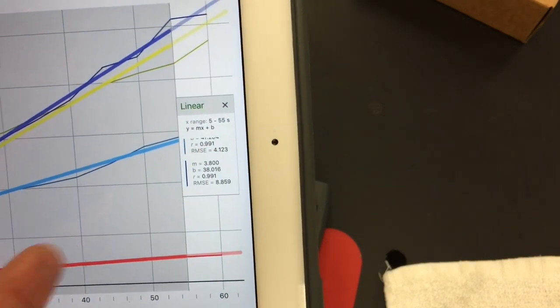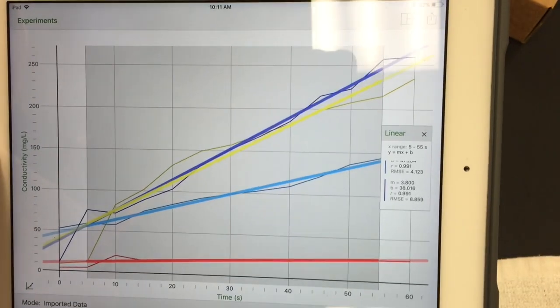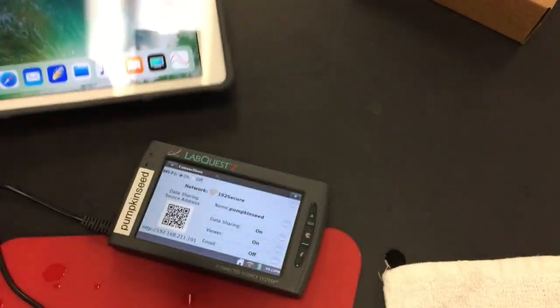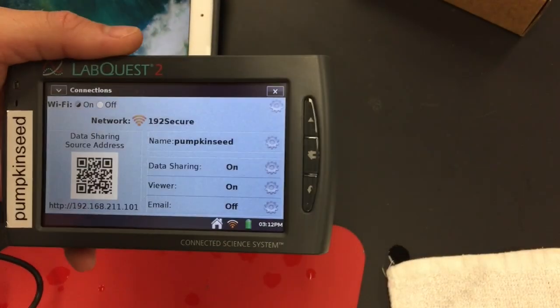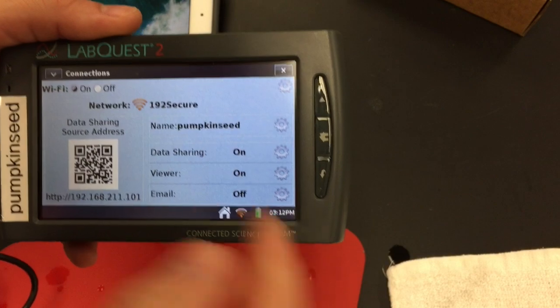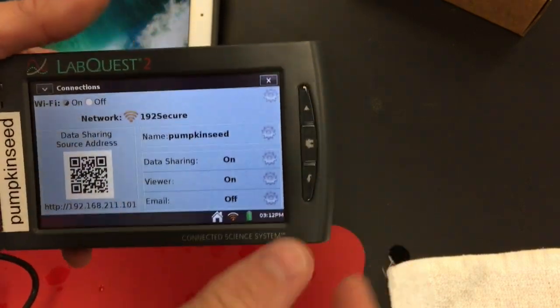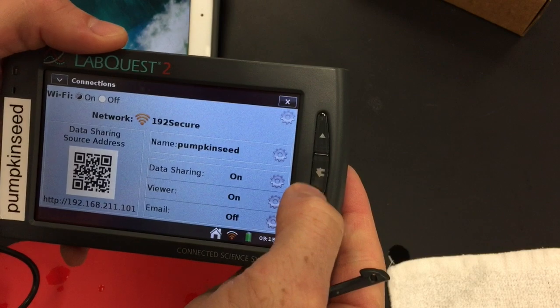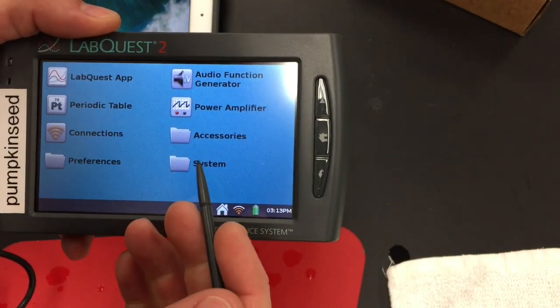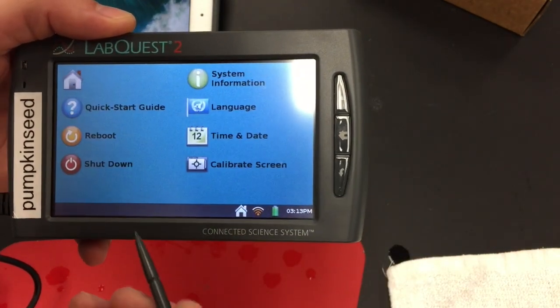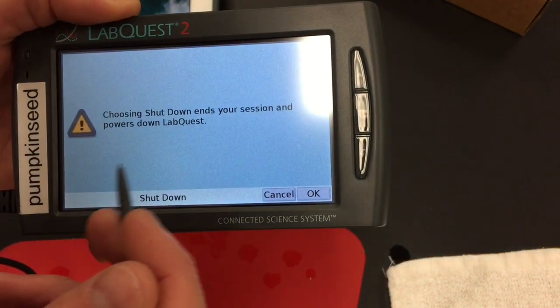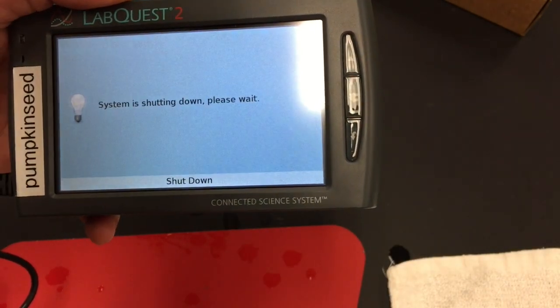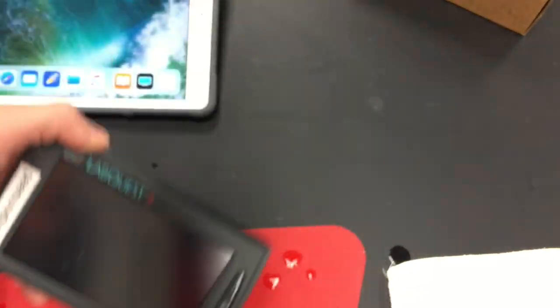One more thing I need to show you is how to turn off the Lab Quest device. You turned it on by hitting the power button, but you're going to turn it off a little differently. Hit the home button and then on-screen hit System, then Shut Down, then OK. Once that's happening you can remove the conductivity meter and plug that back in.